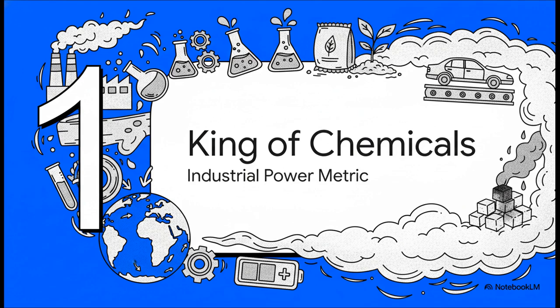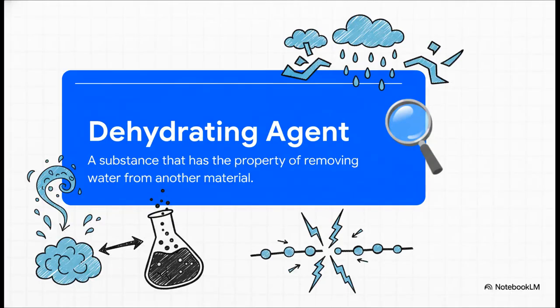But its most defining feature is a little more aggressive. You see, sulfuric acid is what's known as a dehydrating agent, and it is exceptionally good at its job. It doesn't just absorb water that's nearby, it chemically rips water molecules right out of other substances. Now keep that little fact in mind as we meet our next player.